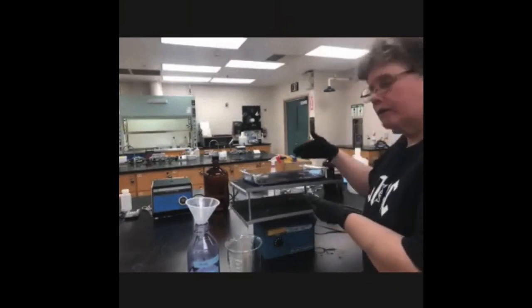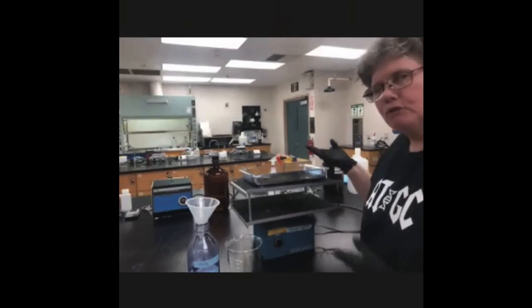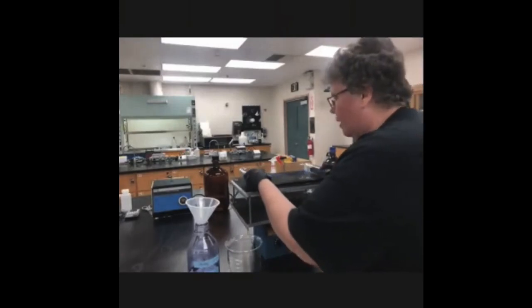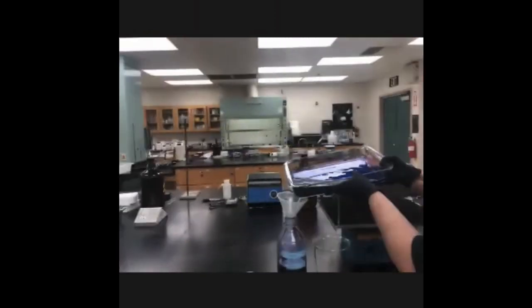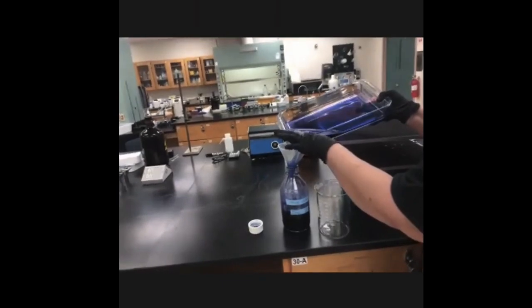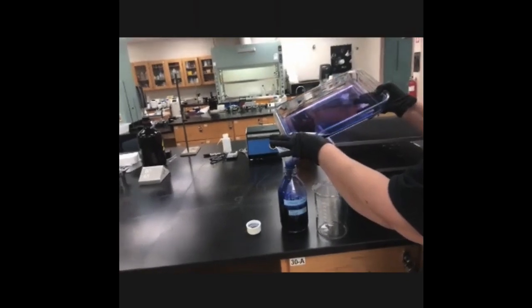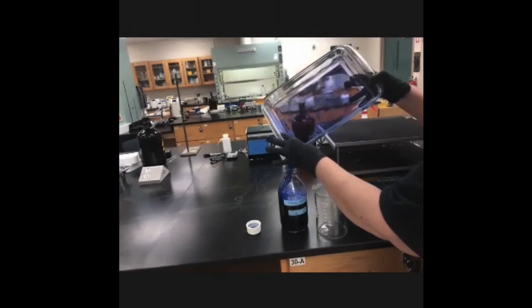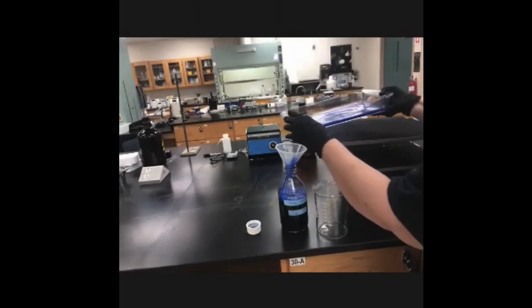Now that our gel has been rocking in the Coomassie Blue solution for approximately an hour, it has been stained and we're ready to destain. So you're going to pour off the staining solution, because the staining solution is reusable, but you don't want to lose your gel when you do that. So you want to put your finger there and make sure that you're not losing your gel in the bottle when you do. Make sure you use a funnel. Make sure you have gloves on, because this will stain your fingers the same way it's staining the gel.